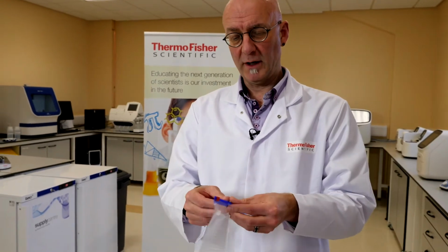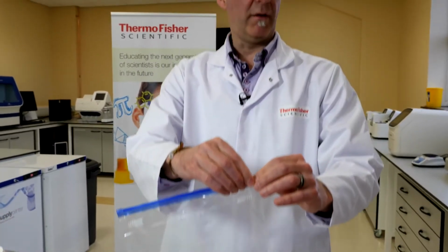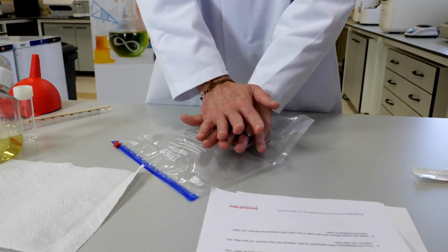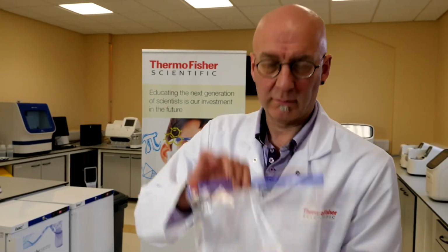We're going to take our strawberry. What we want to do with the strawberry is we actually want to remove the leaves. We're now left with our de-hulled strawberry. What we're going to do is open our bag and pop our strawberry in our bag. Next, very importantly, we're going to make sure that we zip our bag back up. Next, we're going to take the strawberry and crush it with our hands. All you need to do is crush it so that it looks like that.